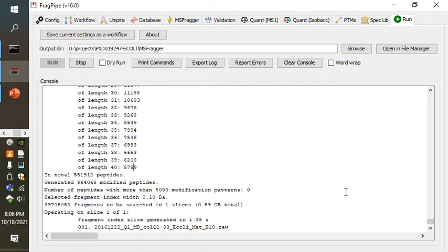So the fragment slice is specifying all the different peptides that might be compared to a given spectrum. And for a given spectrum, we're able to look up very rapidly, using its indexing, which sequence candidates match a fragment of this particular mass. So it's a really, really fast way to compare all of the spectra to all of the precursors that match it very closely in observed mass.